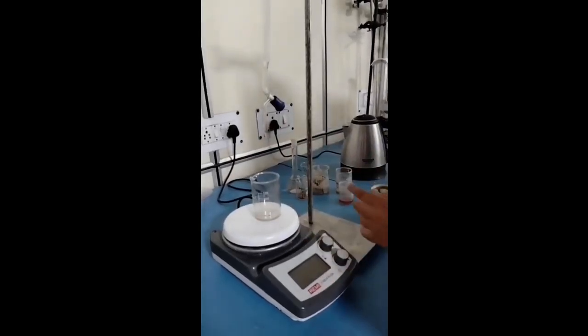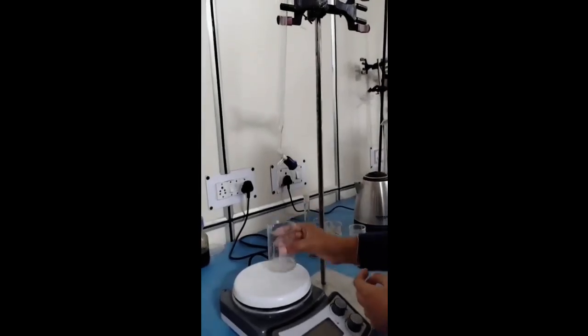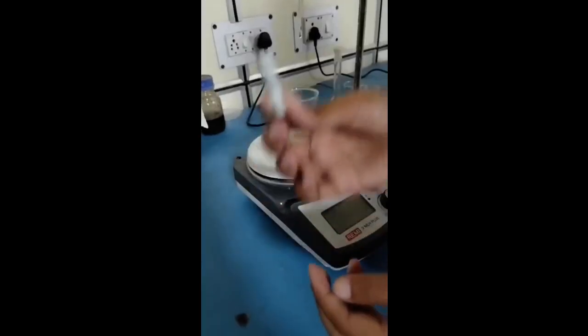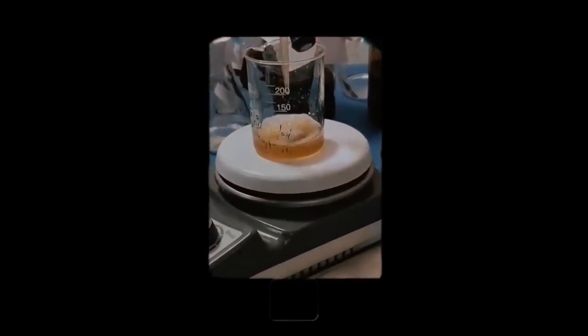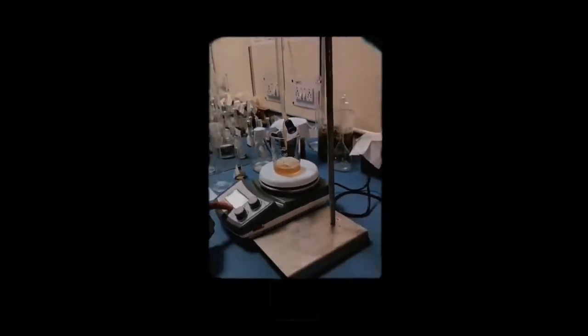Now, we will take 1 normal 40 ml KCl solution into the burette, which will come down drop by drop into the extract or the aliquot we filtered. Now, we will place the magnetic bead and switch on the magnetic stirrer and it will stir for 30 minutes and drop by drop the KCl solution will be poured. After 30 minutes, we'll see our nanoparticles are ready.